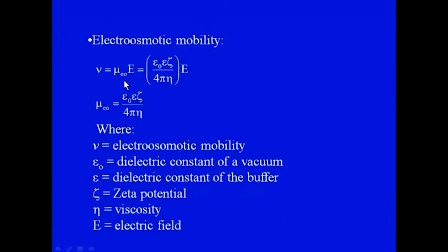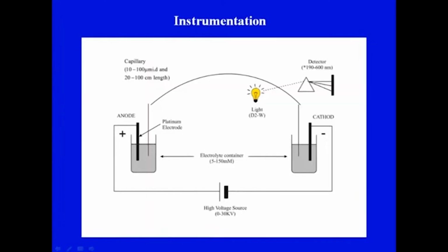These equations here give you an idea about the electroosmotic mobility, which is dependent on the dielectric constant of the buffer, zeta potential, viscosity, and electric field. All these factors affect the mobility.